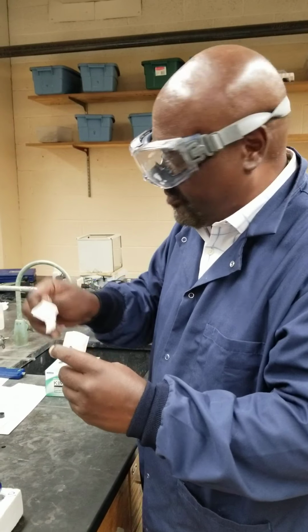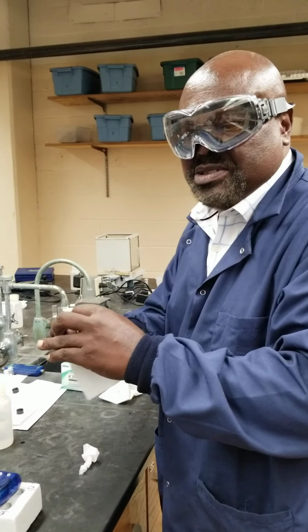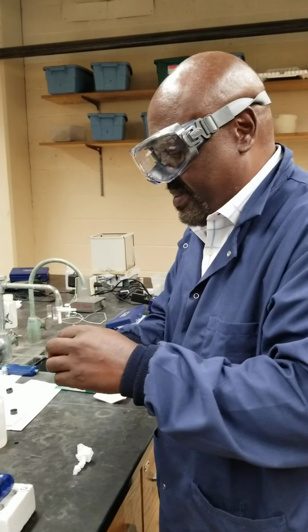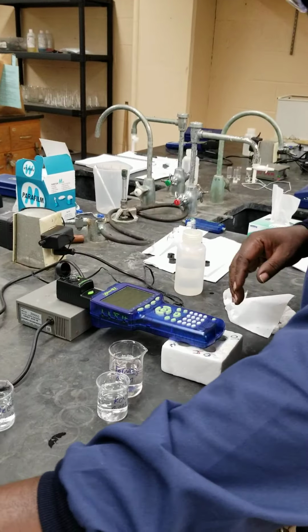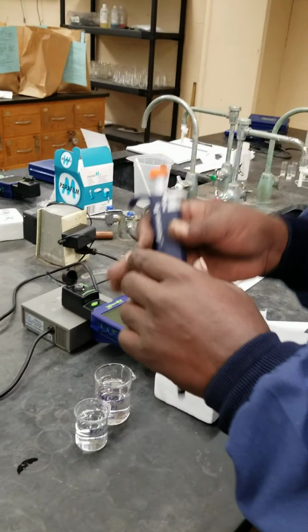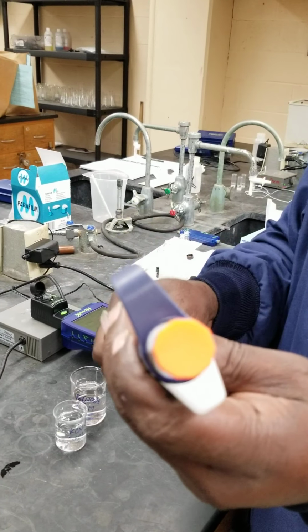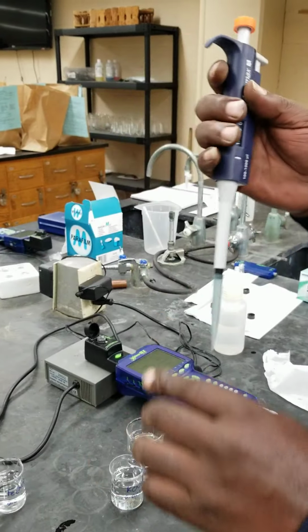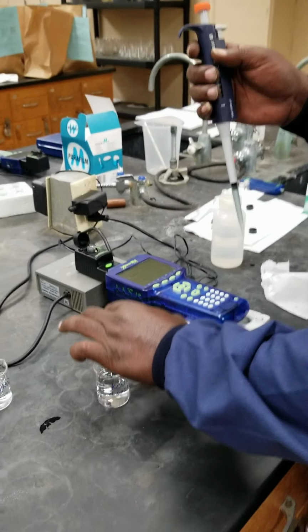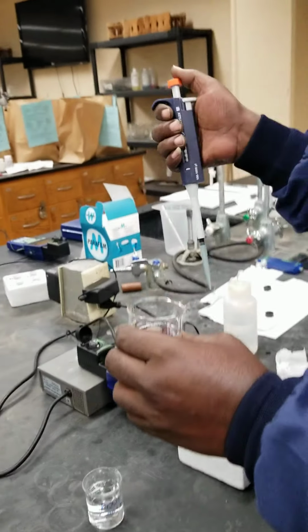So I'm using a Chem wipe to dry it inside, then of course wipe it on the outside again. And then I'm going to put in 4 milliliters. Pipette tip, put it in. That's 1 milliliter each. It calls for 4 of the 0.2 molar iron 3+. Show the label.